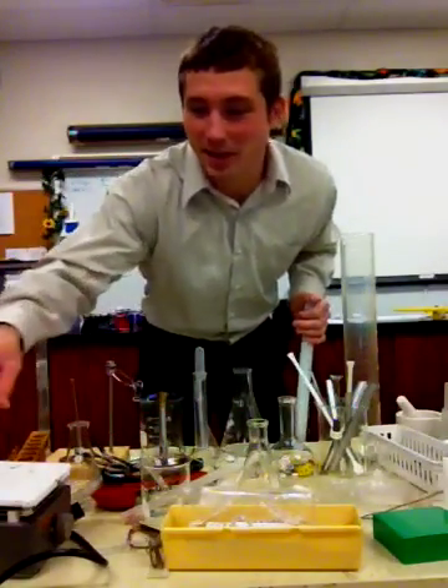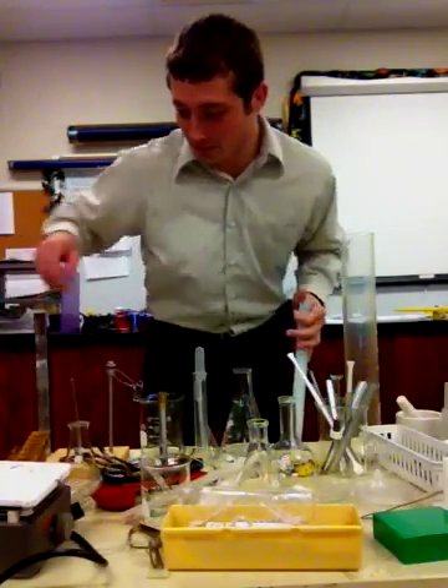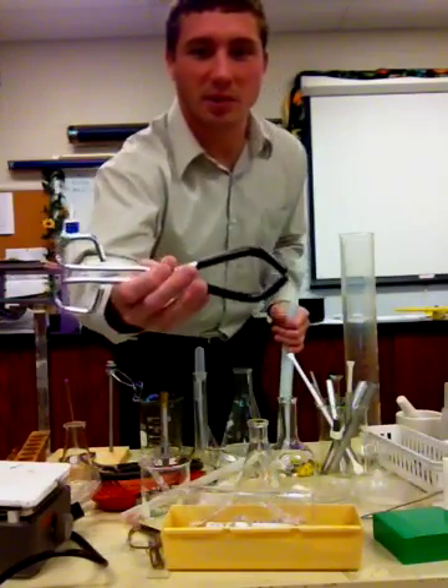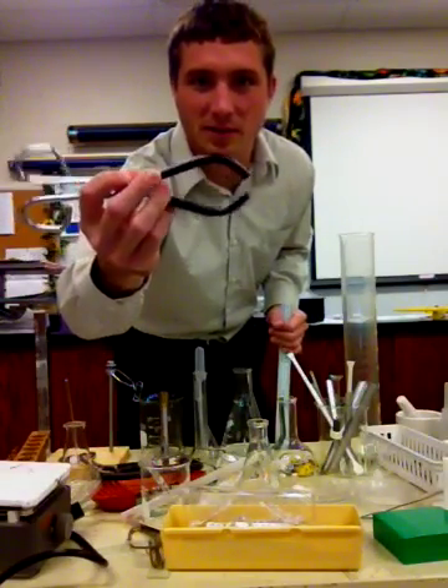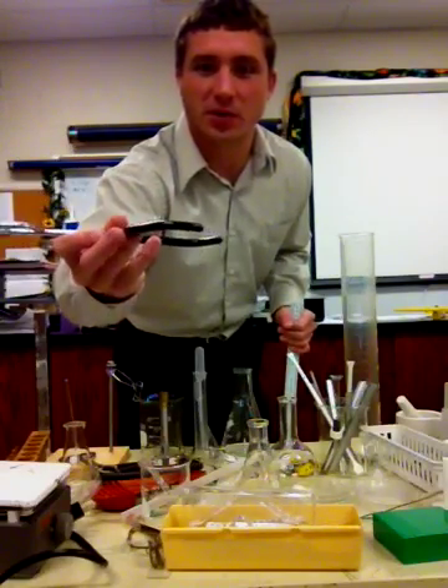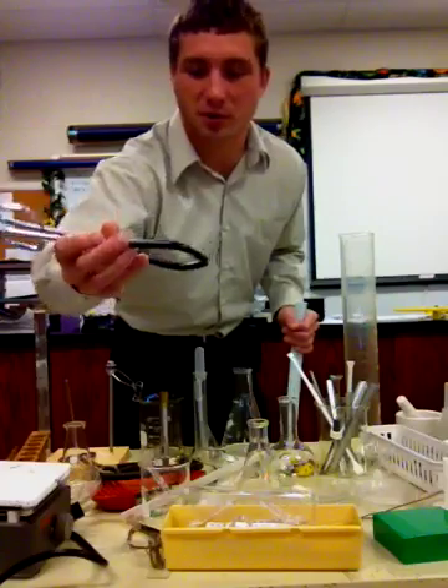All right ladies and gentlemen, this is a lab equipment overview. First off we have the beaker tongs, and you'll notice it has little rubber ends on the end of it so that you can grasp a beaker and it won't slip out of your grip.